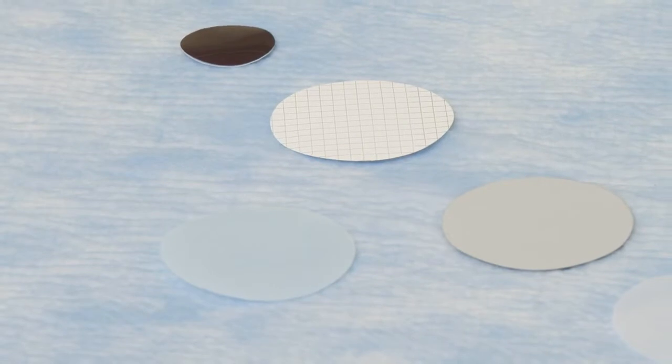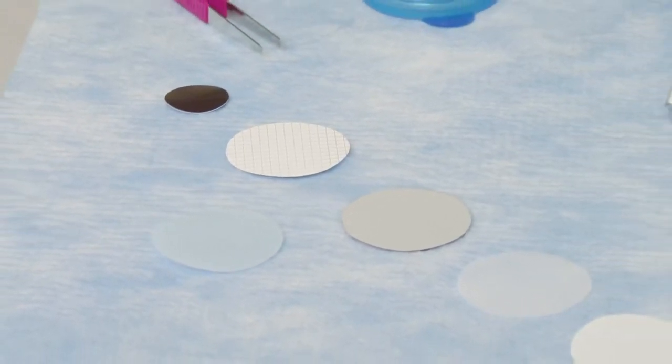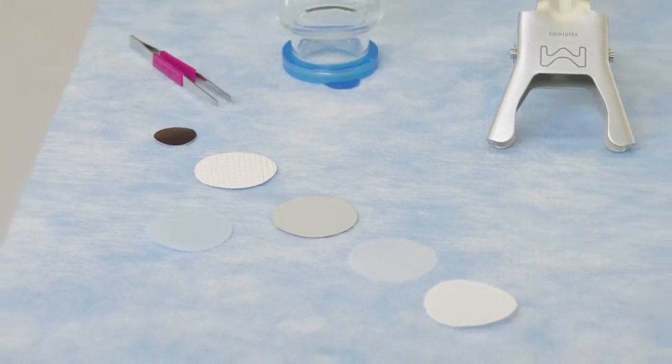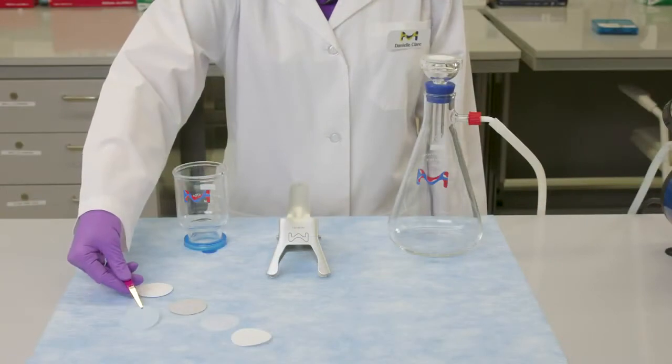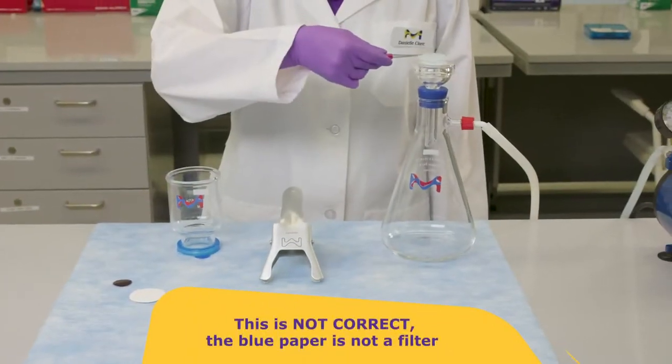The non-blue disks are the membrane filters. These can be white, black, gridded, or non-gridded. The blue disks are always anti-static paper separating and protecting the membrane filters. These blue disks should never be used as filters.